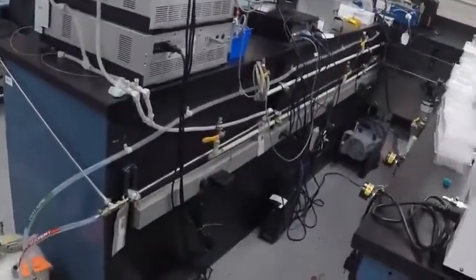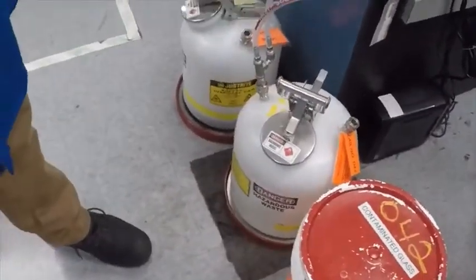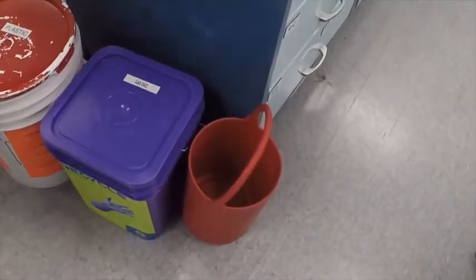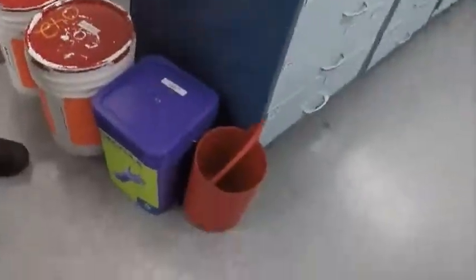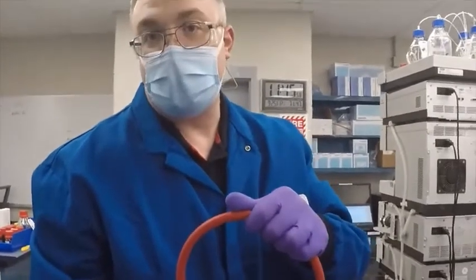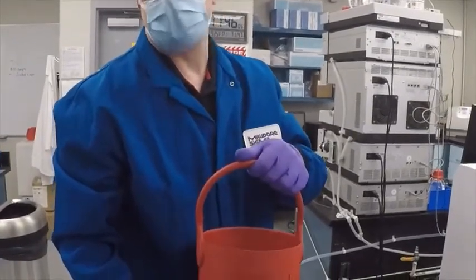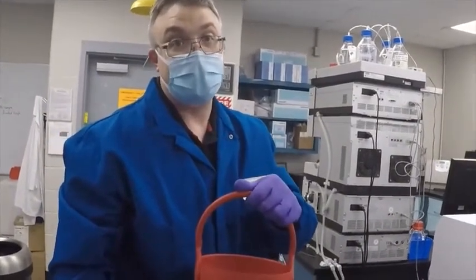The HPLC waste setup here routes waste directly into the lines and into waste buckets, so you don't have to worry about a bottle overflowing. Regarding transporting materials around your lab, you should always use secondary containment. These totes are used for transporting up to a gallon of material — if dropped, any material that leaks from a cracked bottle is contained. It also creates a bumper to help prevent the bottle from breaking. As a good practice, always use secondary containment when transporting anything in your chemical laboratory.